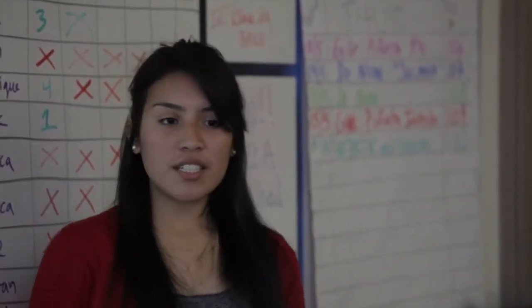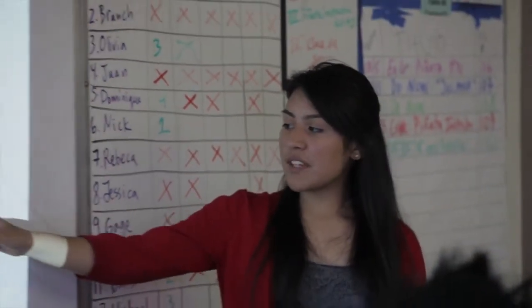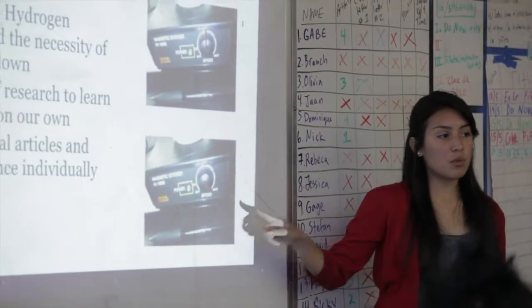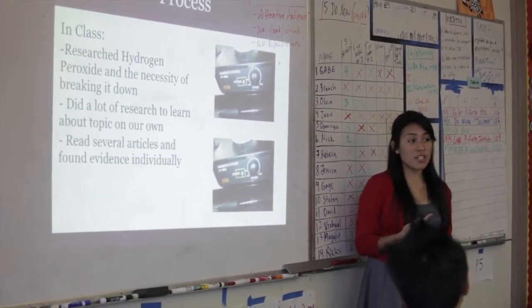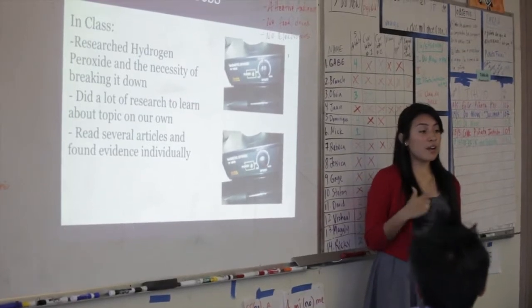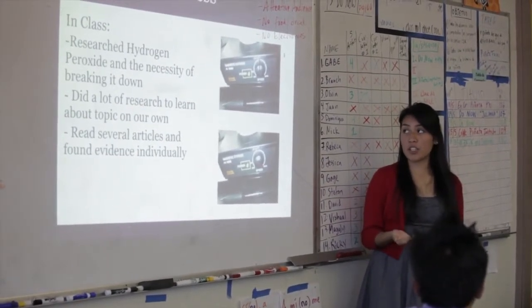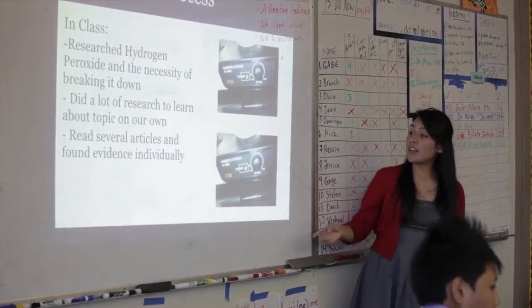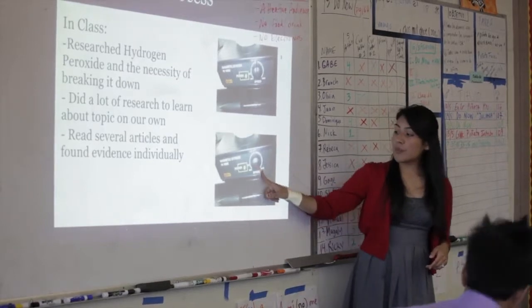And then the last one is, we had it on specific speeds because our independent variable was the stirring speed. We said that if you change the stirring speed, then the rate at which it decomposes, or the rate at which the reaction occurs, is going to change. And so we had 3 different speeds. We had one at low, one at medium, and then one at high.